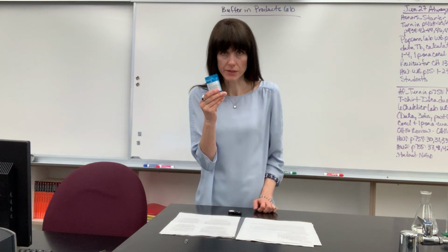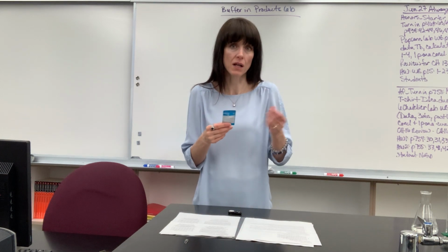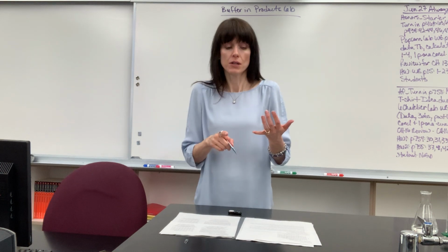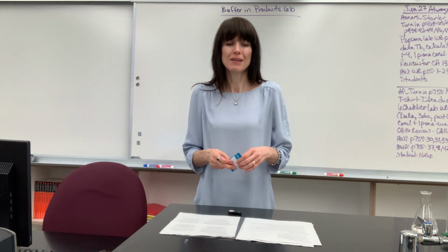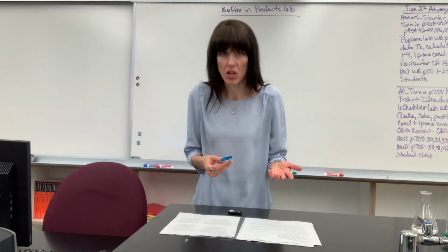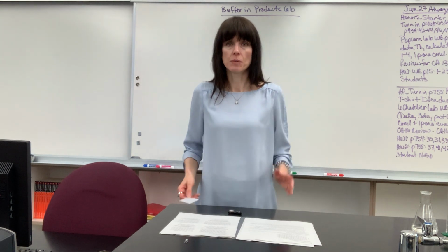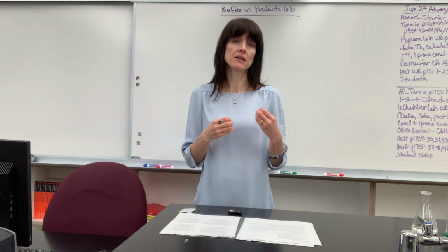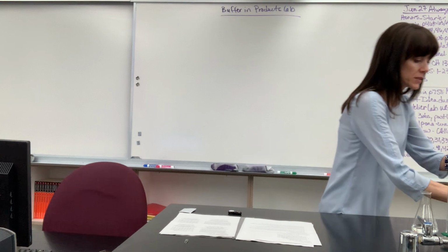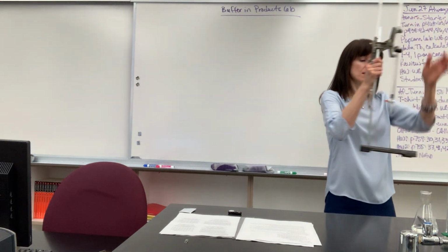This right here is a solid. A tomato paste would be a solid, but then you could have some solutions like a sports drink or a juice. You could even do a cleaning supply and test the buffering ability. So number one, you've got to get it in a solution. You need at least 50 mils. Then what you're going to do is a titration.